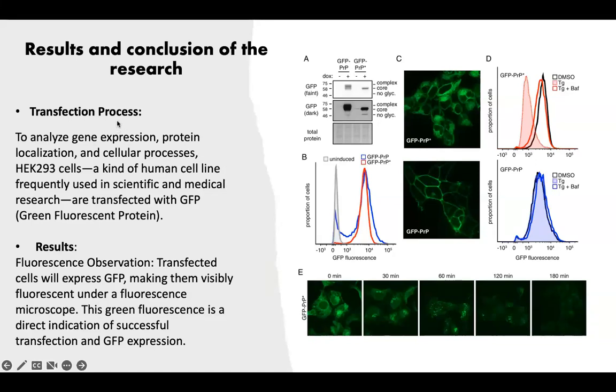I've explained the transfection process, and how to analyze the gene expression and the protein localization, as well as the cellular processes in the mammalian host cell.